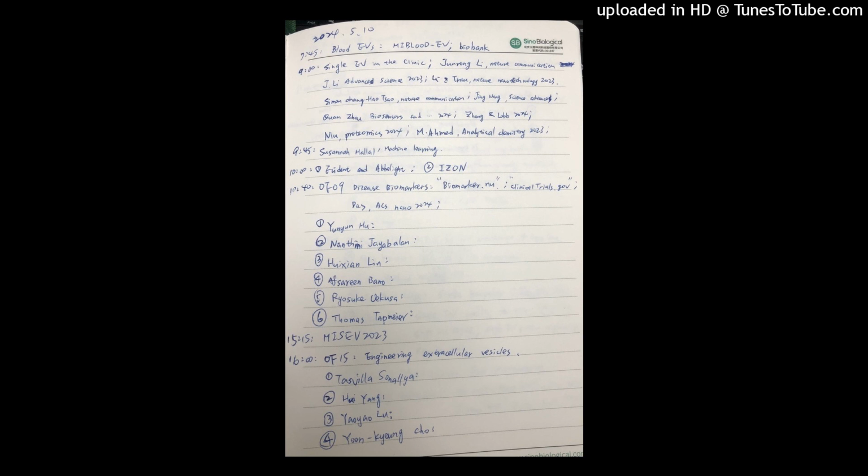What was your first question? So we're working with mouse plasma. Yeah. So you only get a small volume of plasma out of a mouse. So maybe 500 microliters if you're lucky. So in the guidelines that have been written, it'd be nice to have specific guidelines for small animals. So for instance, you can't leave a mil of plasma because that's all. Yeah, so this refers back to the earlier question.